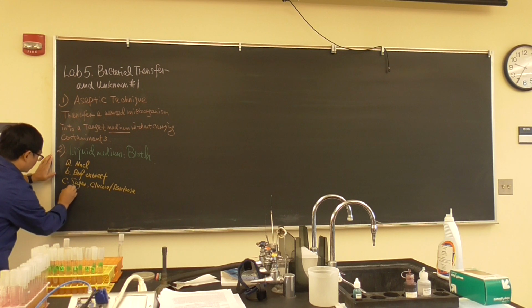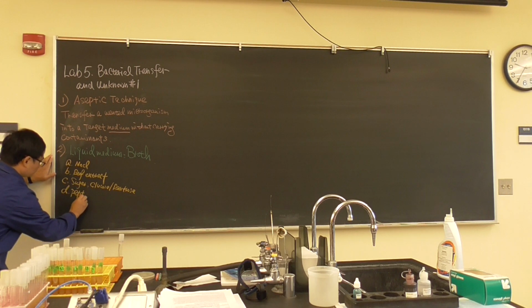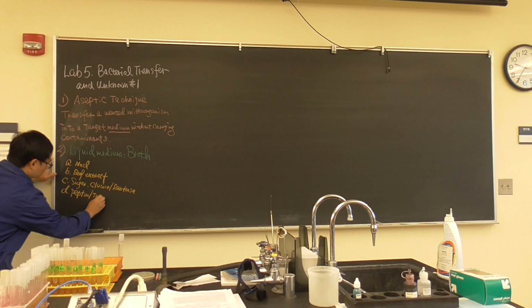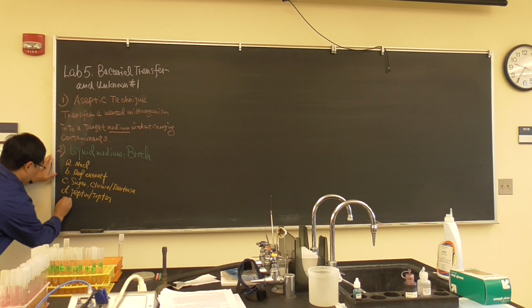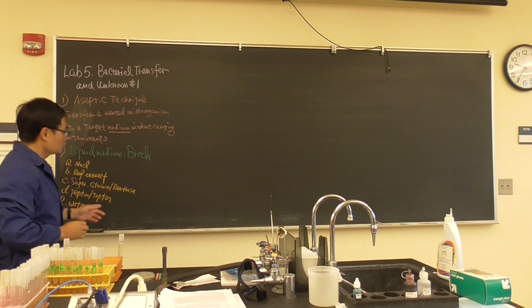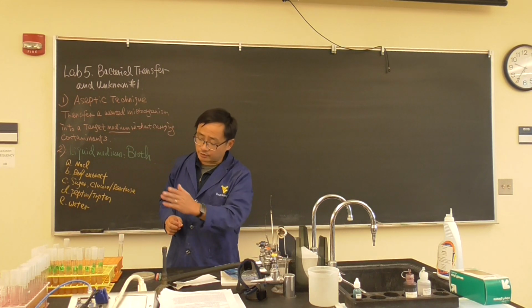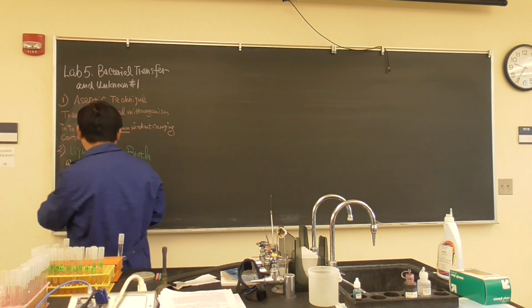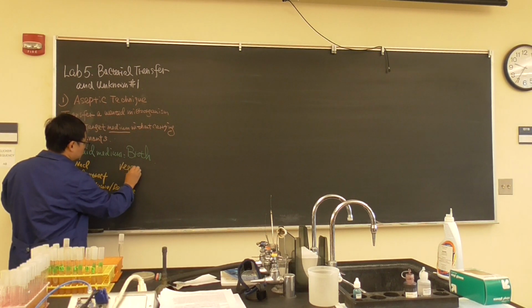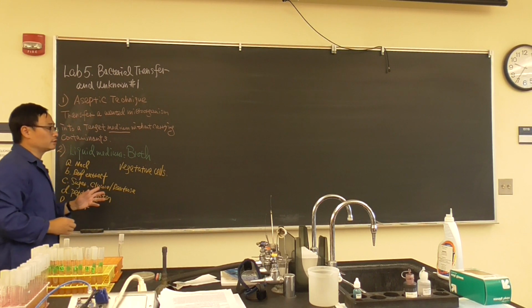They also have something from protein, which we call peptone or tryptone. And very important, of course, there is water. So the major ingredients give very high nutrition for bacteria to grow. We have to emphasize that the bacteria in the broth grow as what we usually call vegetative cells. That's how normal bacteria grow.